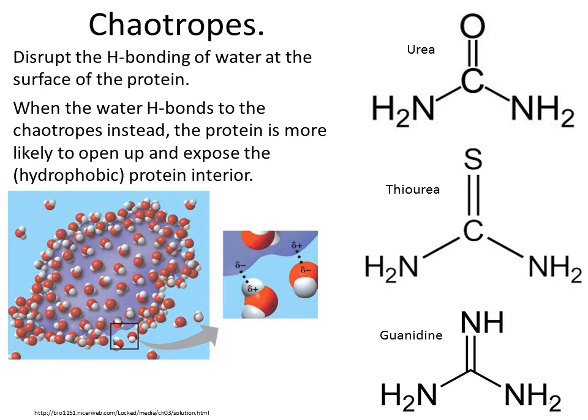If the chaotrope needs to be removed, it's most often achieved using either dilution, dialysis, or precipitation of the proteins. But it must be noted that upon chaotrope removal, it is very unlikely that all the proteins will still be soluble in the non-chaotrope solution, and some will be lost through precipitation.